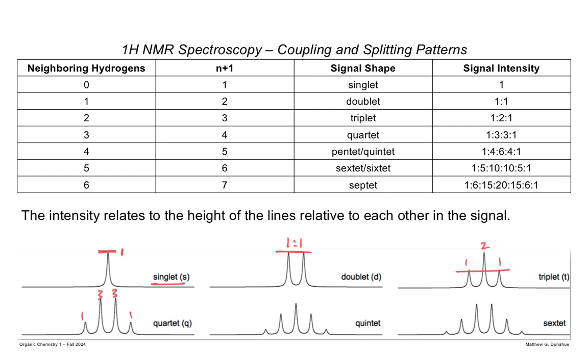And then the higher order ones, you can see as you add more lines, the little peaks at the end become smaller, and they're almost buried in the baseline. So for example, these little blips here, they don't really rise too much above the baseline.